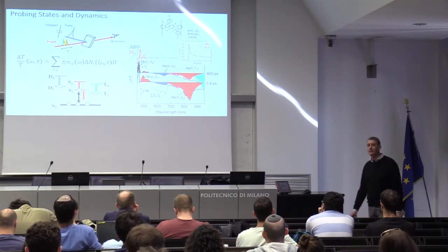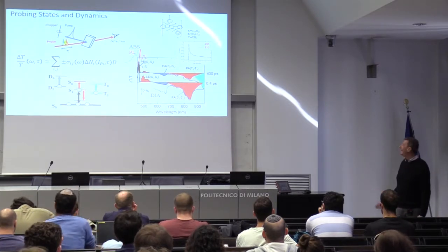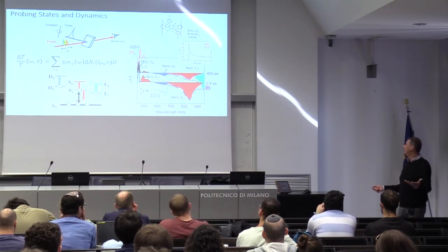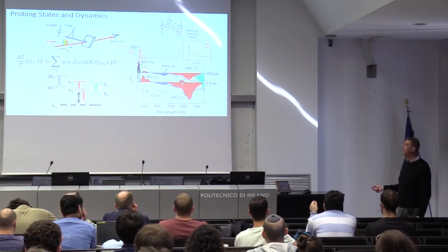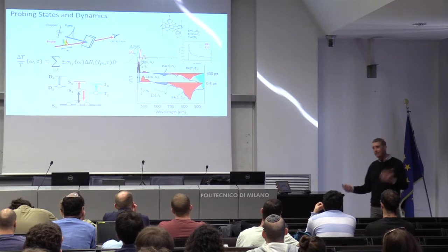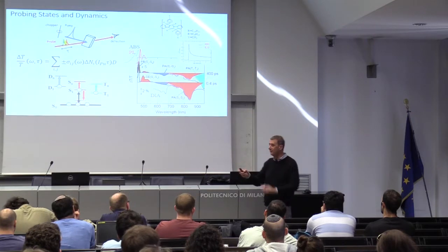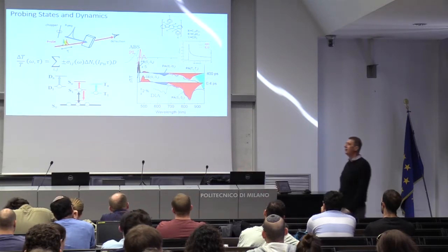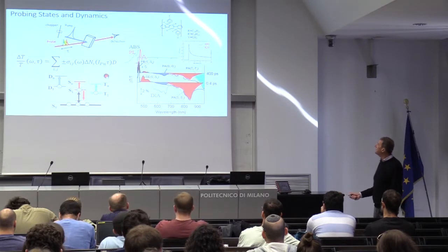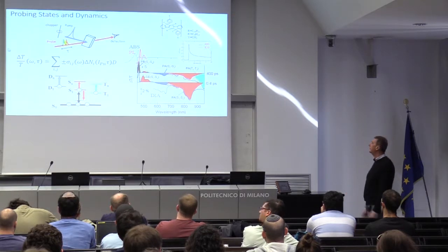It is a long-lived state, which is appearing at, say, below 1 micron. That is exactly where, from other spectroscopy, you see the triplet is absorbing. So this is a triplet absorption. So I get everything: triplet, singlet, charges. That's unusual. I mean, most of the time, you have everything on top in the same position, and it's very difficult to understand what is going on. But here is a good example, and you can perfectly reproduce this spectrum using this formula. Each sigma is the shape of the peak, and this is the kinetics that you put in the population. So it's very simple.